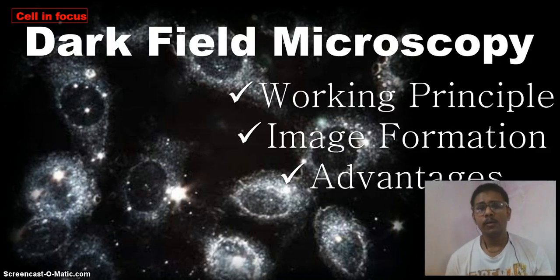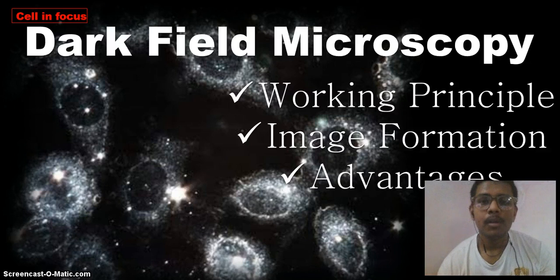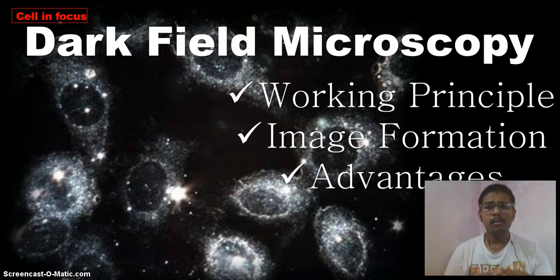Dark field microscopy is a very useful technique where you can use your sample without staining. That's the uniqueness of dark field microscopy: you don't have to stain your sample. That is its main uniqueness.